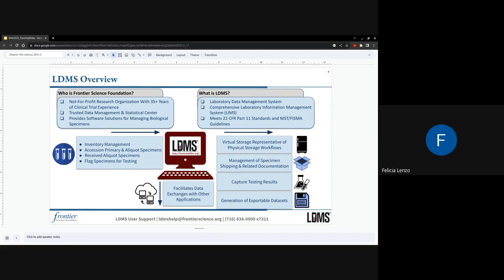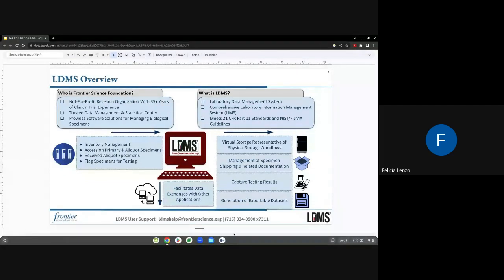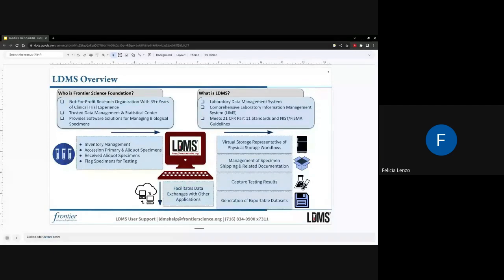LDMS will also capture certain test results, and we can generate exportable data sets for internal documentation and external collaborators. LDMS can facilitate data exchange with other LDMS-based applications, allowing us to compile data across different clinical trial networks.